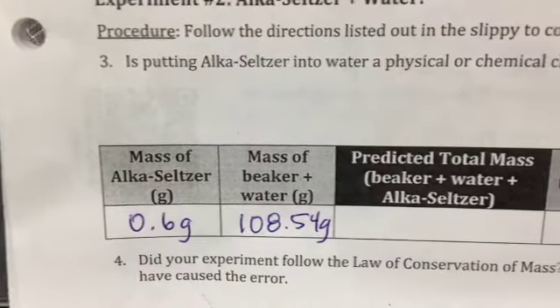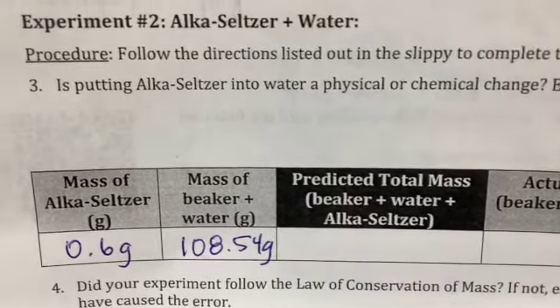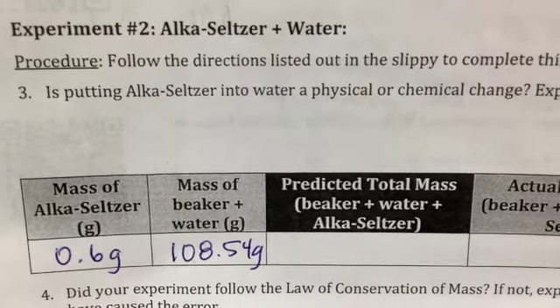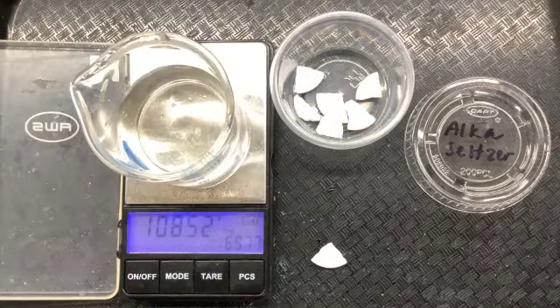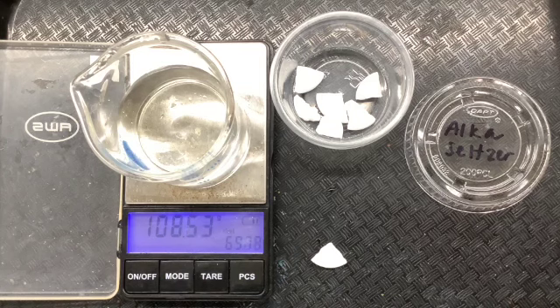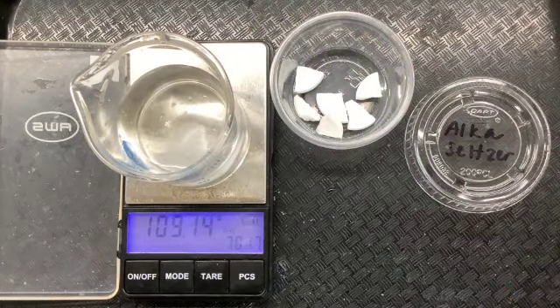Okay, so the next thing we're going to do is predict the total mass of the beaker plus the water plus the Alka-Seltzer. So you're going to make a prediction right there. Write in your prediction right now. So hopefully you took time to pause the video if you needed to make your prediction. And then our next step is we are going to record the actual mass of the beaker and the water and the Alka-Seltzer. So I'm putting the Alka-Seltzer in.